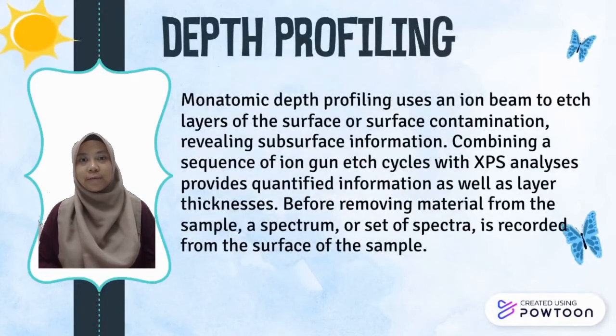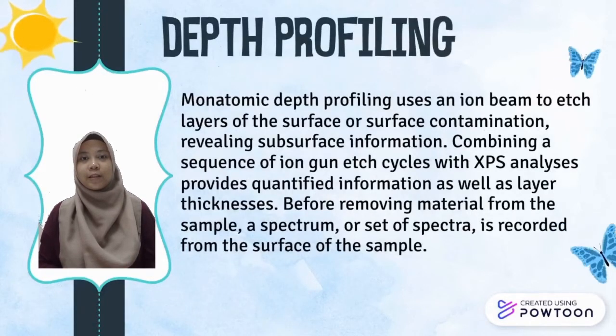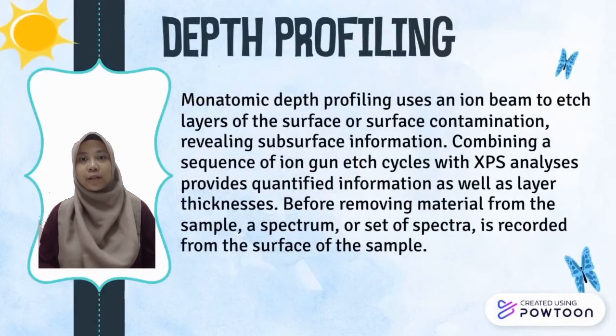Depth profiling uses an ion beam to etch layers of the surface. The combination of a sequence of ion gun etch cycles with XPS analysis provides quantified information as well as layer thickness.